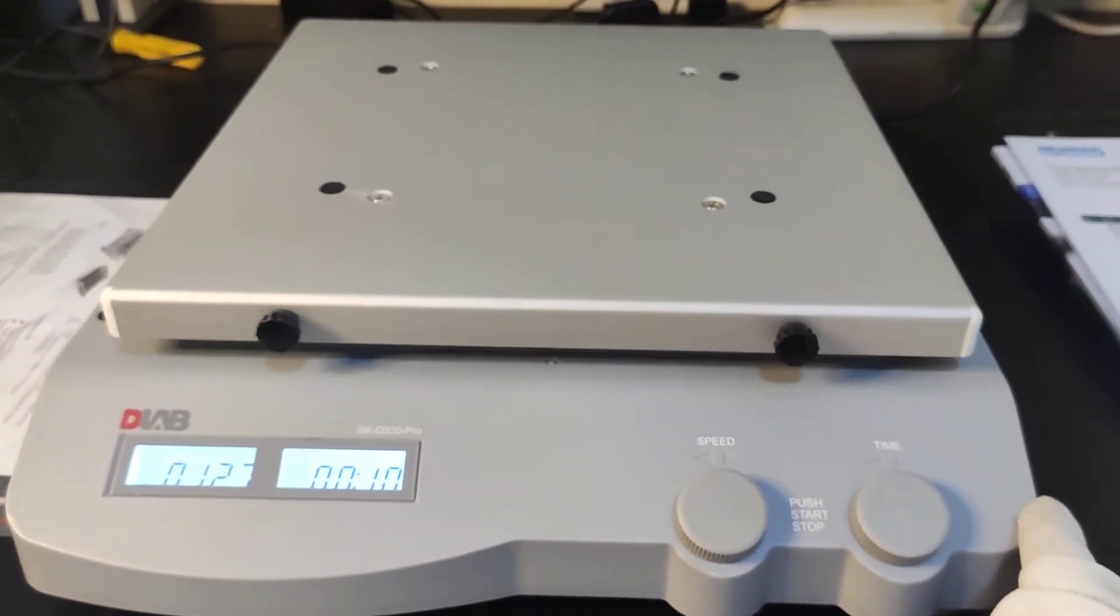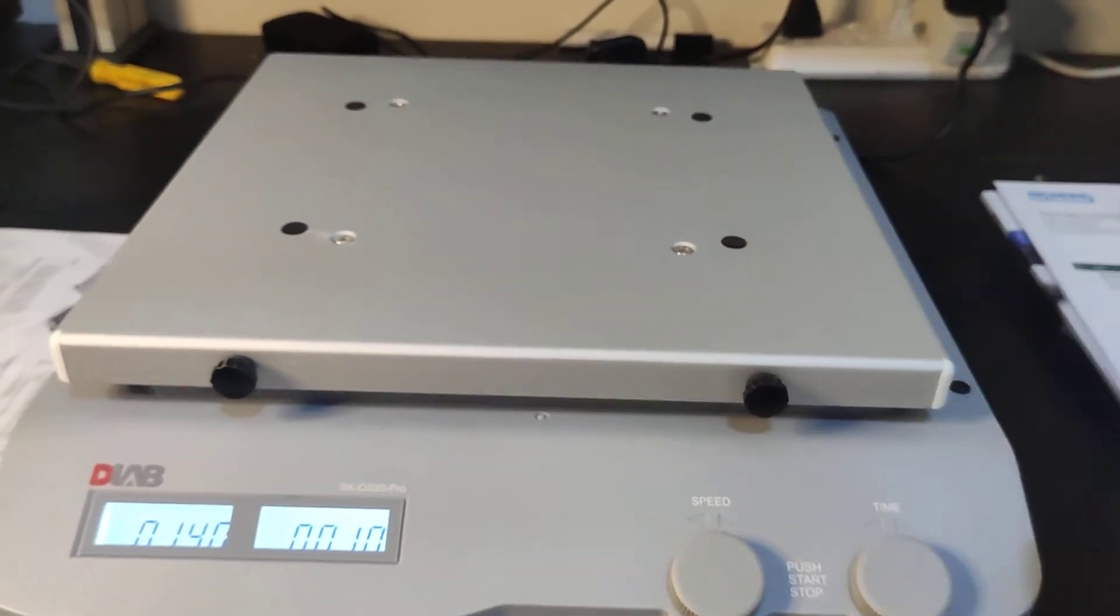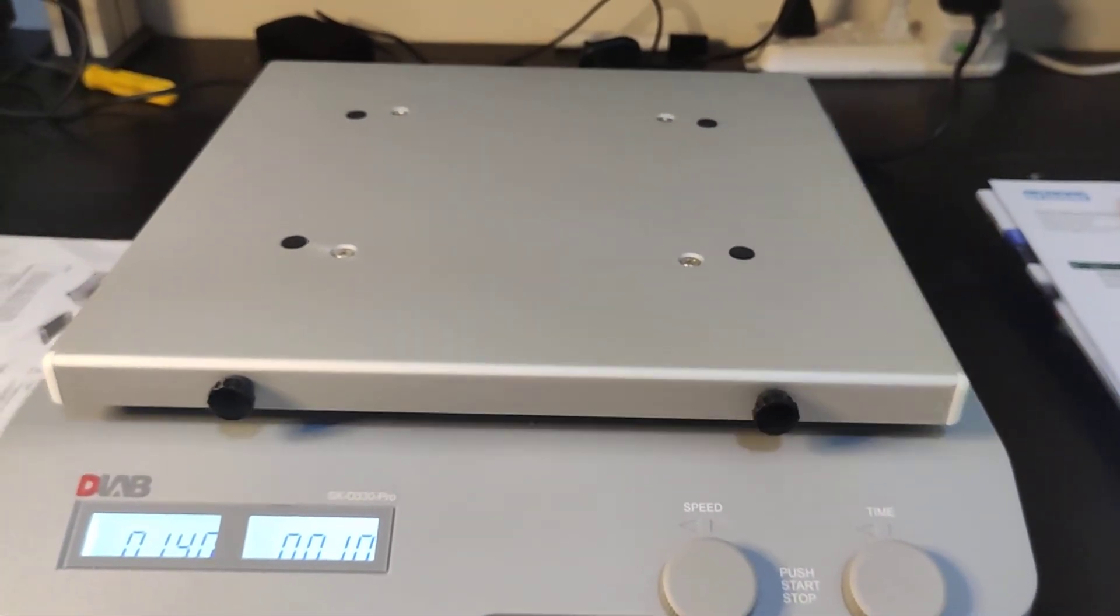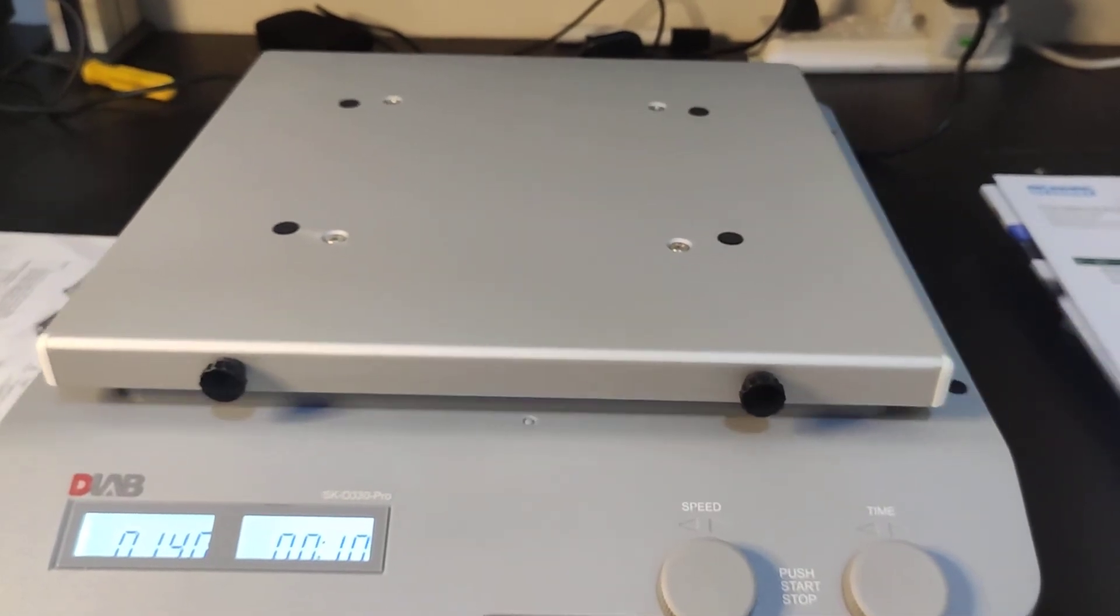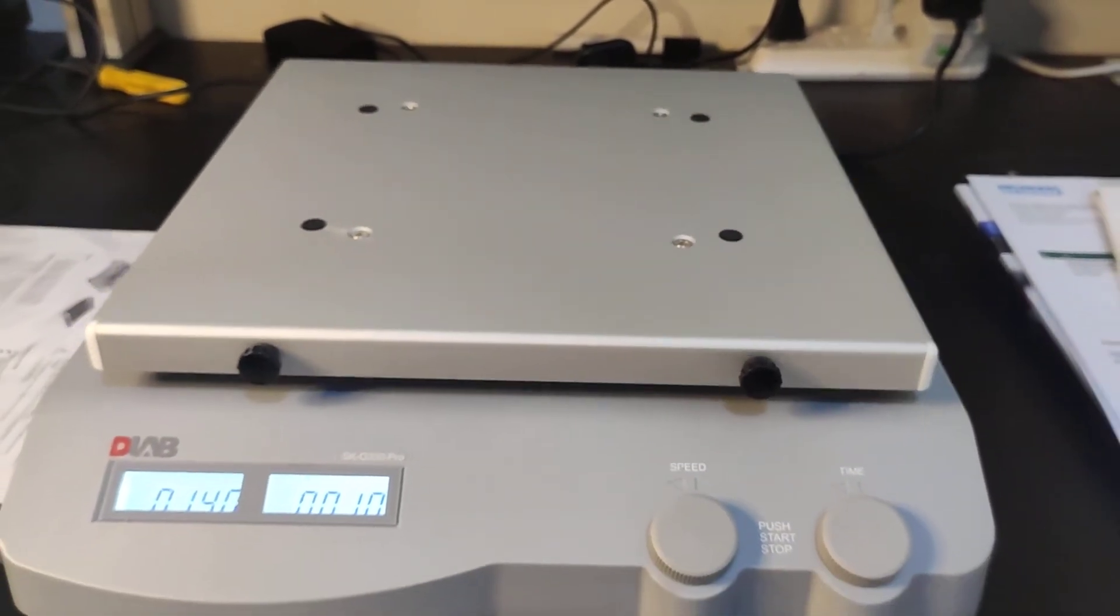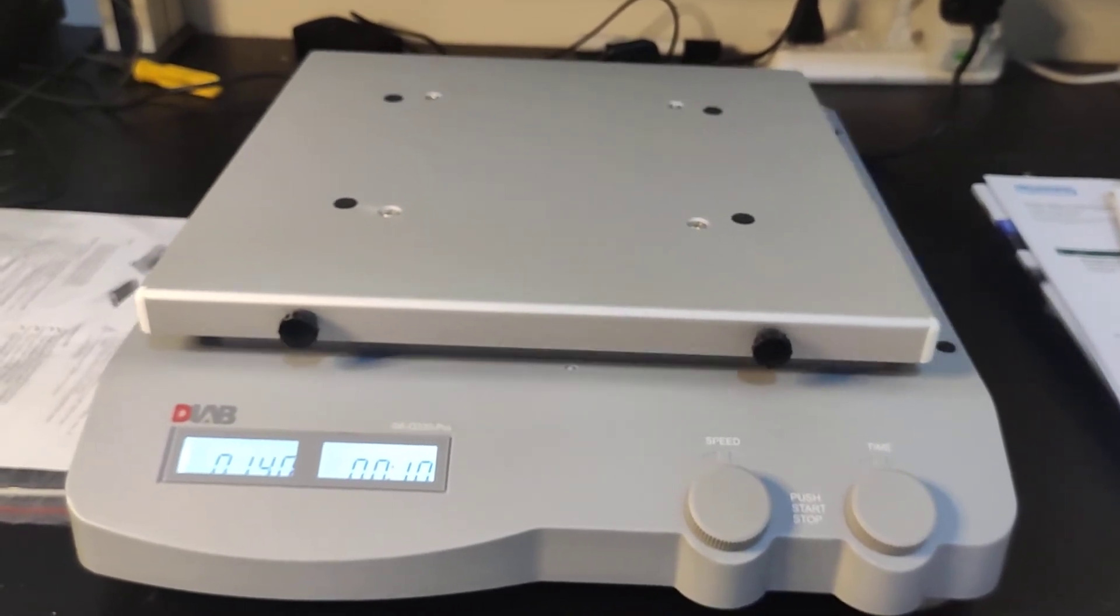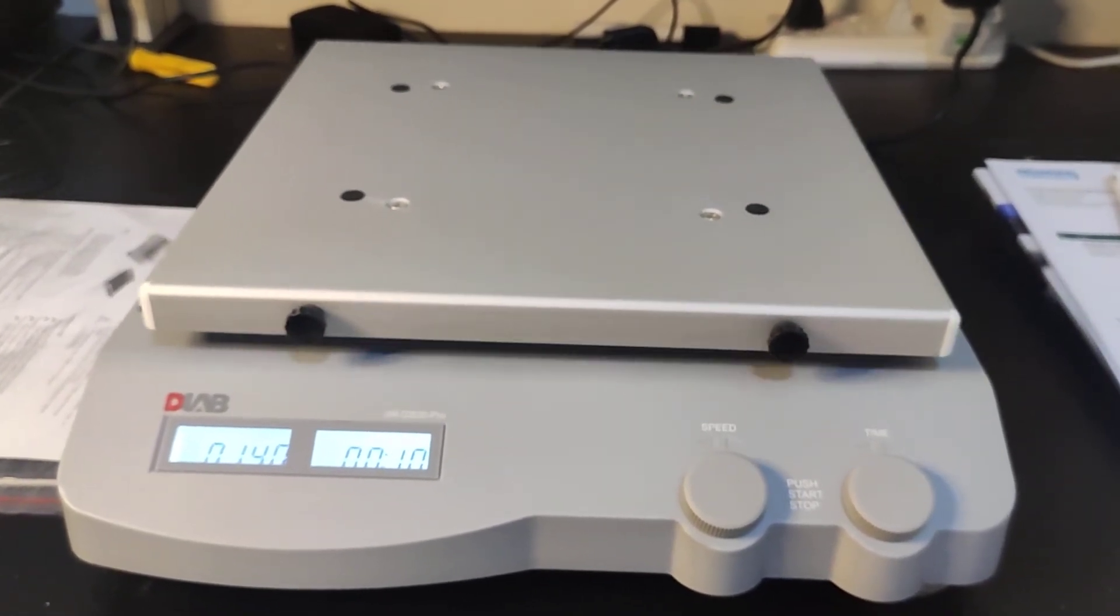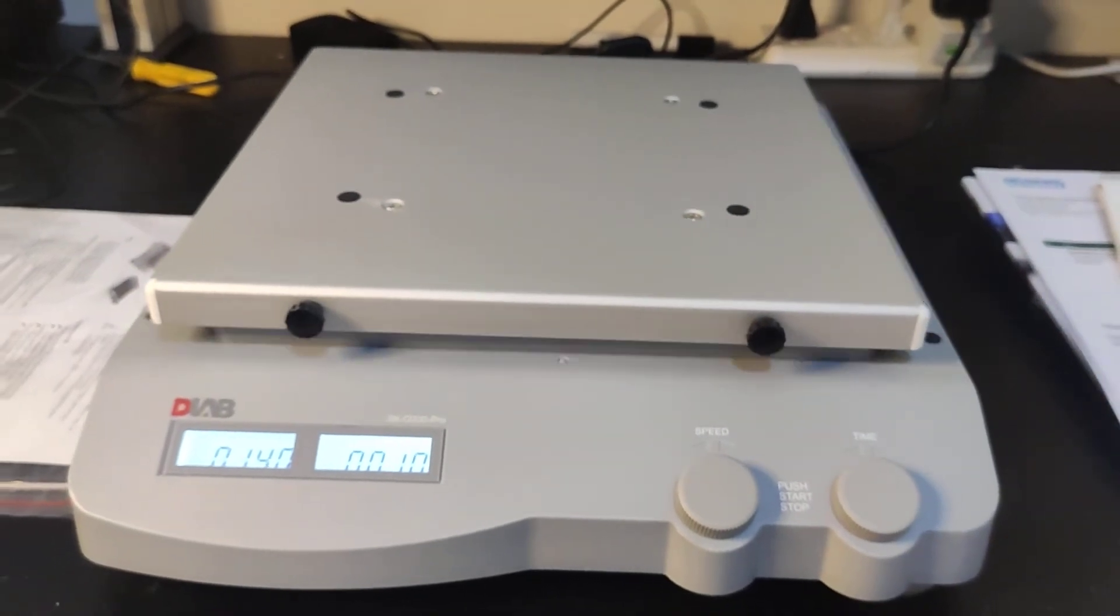The machine starts to run. This one still didn't attach with a top plate. On the top plate, we can put the containers, beakers, whatsoever we use for our experiment.